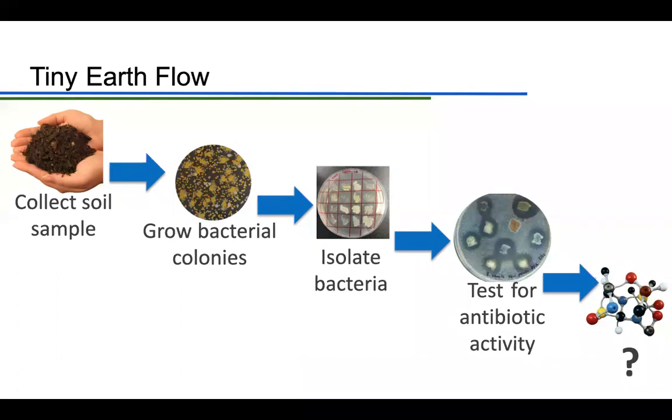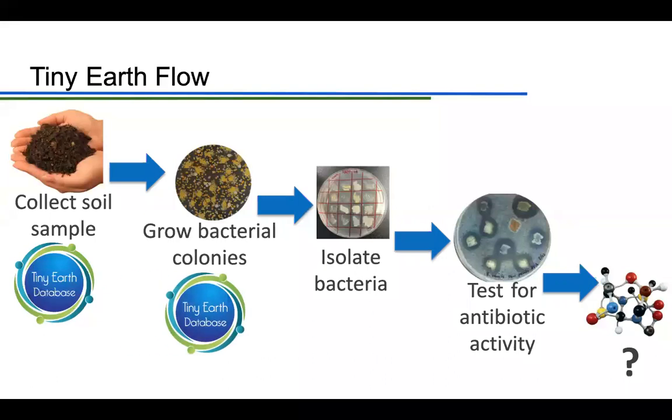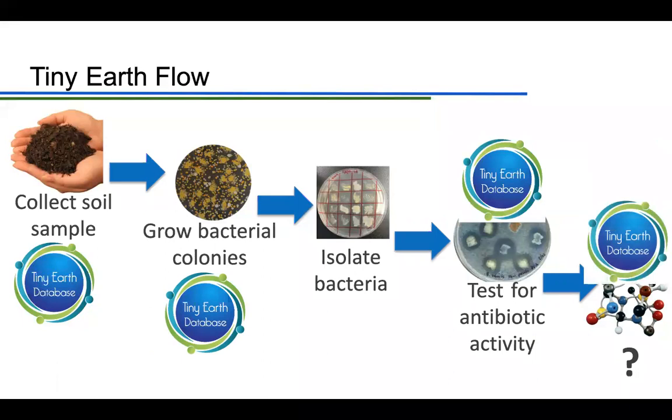The database collects information on your soil sample. So that's a way that you can enter. It also has a space for your culture conditions, your ESKAPE test, and other tests you may do in your classroom. So Martel will be going into detail on each of these entries later on, so stay tuned.